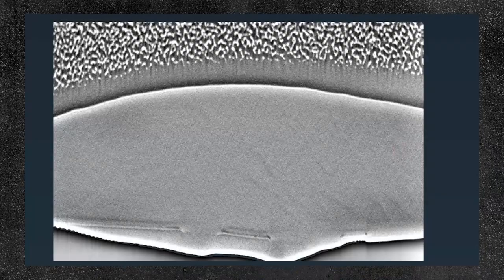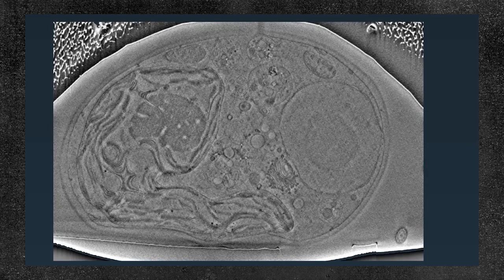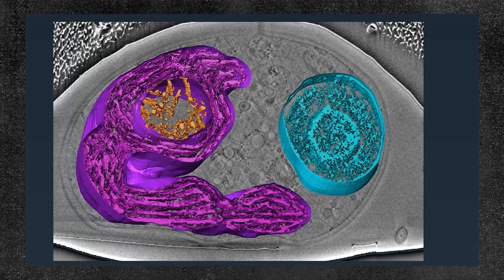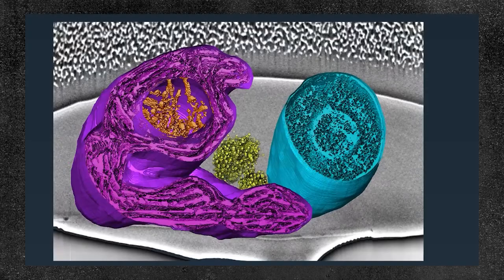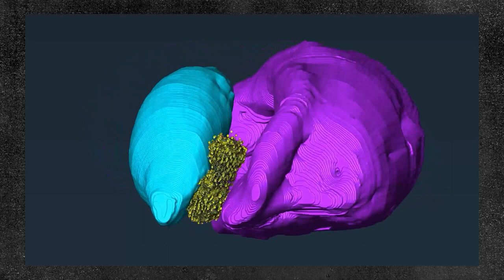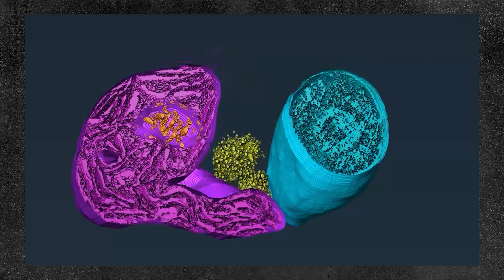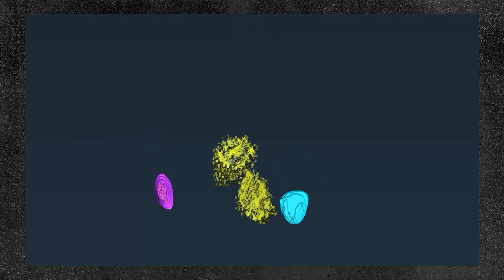Yeah, so this is actually a single algae cell, and what you're seeing is all the little planes that are acquired in these serial sections. And then, of course, we can segment out the structures inside that are biologically relevant. In the case on the left, the purple, for those who can't see, is a chloroplast, which is responsible for photosynthesis. The cyan-colored structure is the nucleus. Inside, the yellow is the Golgi body, which is involved with secretion in the cell. All of these are put together and captured in a full volume. We have all of the context, the spatial information. Of course, you can look at other important cell structures like mitochondria and endoplasmic reticulum. Whatever we can contrast, we can go in and segment and then find their spatial relationships. And just as importantly, pathologies, because a lot of times we're looking at disease and we want to know the difference between a diseased cell and a healthy cell.